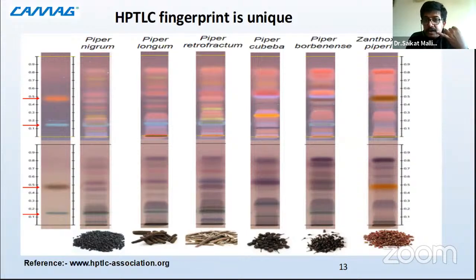their phytochemical makeup, how they are different? And here you can find there's the HPTLC, which does a complete profiling. Initially, if I use this marker, which you can see I have highlighted with arrows, a red color and the fluorescent blue color marker, which is seen across all the varieties. The bluish fluorescence is present across all the tracks, so it is very difficult for me to say whether it is present or absent. But the yellow is very selective to only a few samples.